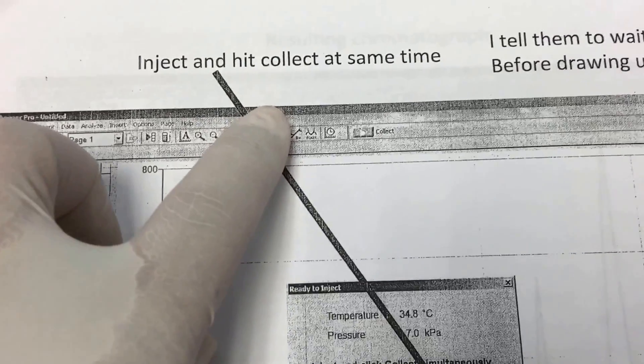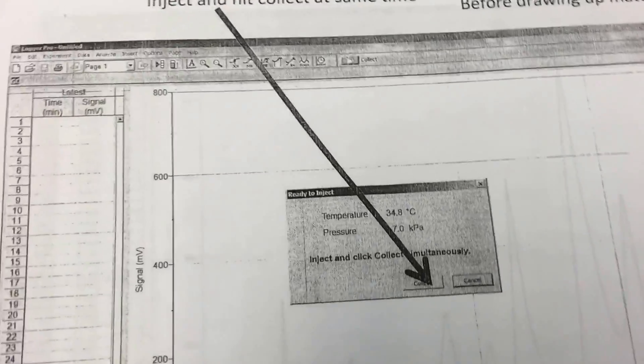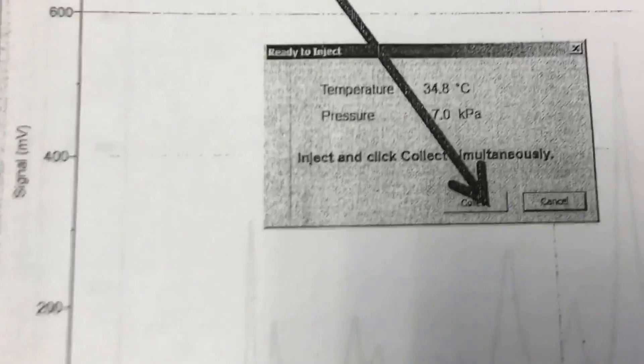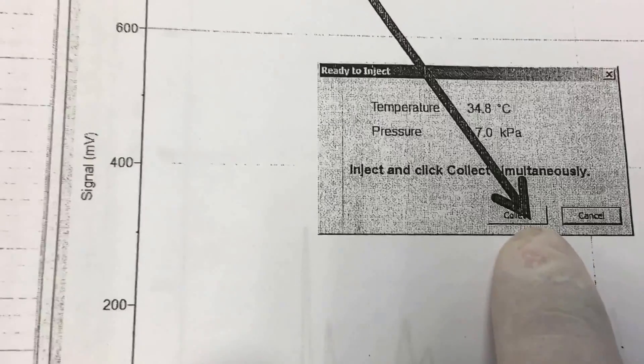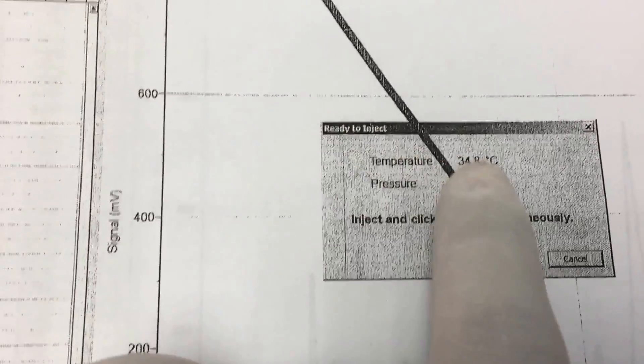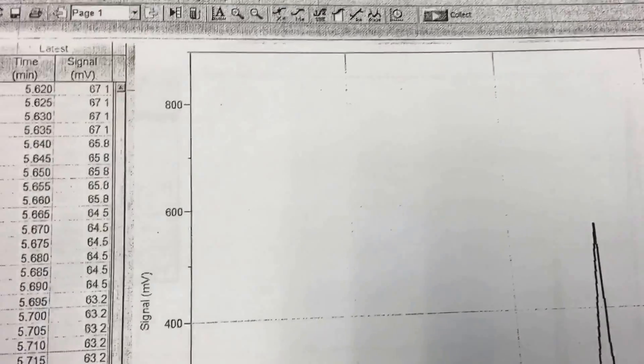You inject your sample from the mini syringe — remember, be careful with it, don't drop or break it. Then click 'collect' and data will be collected based on the parameters you have set.